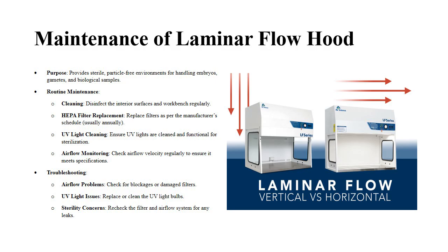D. Laminar flow hood. Purpose: provides a sterile working environment for handling gametes, embryos, and biological samples. Routine maintenance, cleaning: clean the interior surfaces, workbench, and airflow components with 70% ethanol or another appropriate disinfectant after each use.